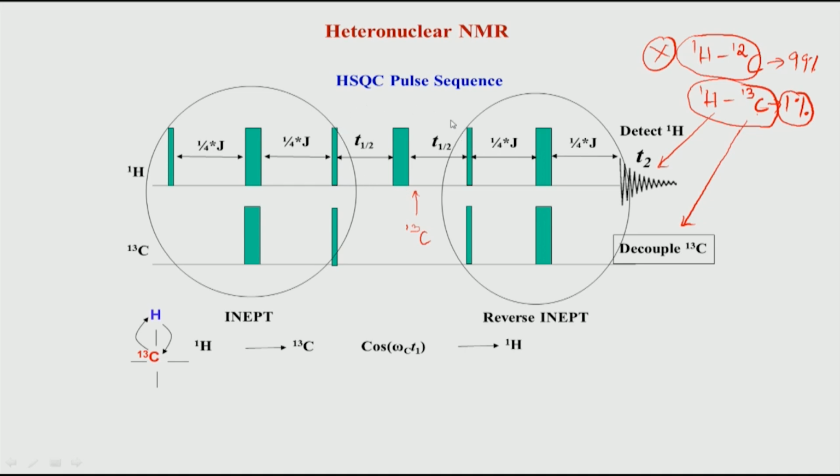So, that is a rule in NMR which we will not go into in detail, but if you keep a proton along the z axis, it stays uncoupled to any other protons, and during that whole period, as long as it is in the z direction, it will not be coupled to any proton. And this is just a 180, it is not a 90-degree pulse, so that will not affect that coupling. The coupling will remain 0, I mean it will not be coupled between two protons.